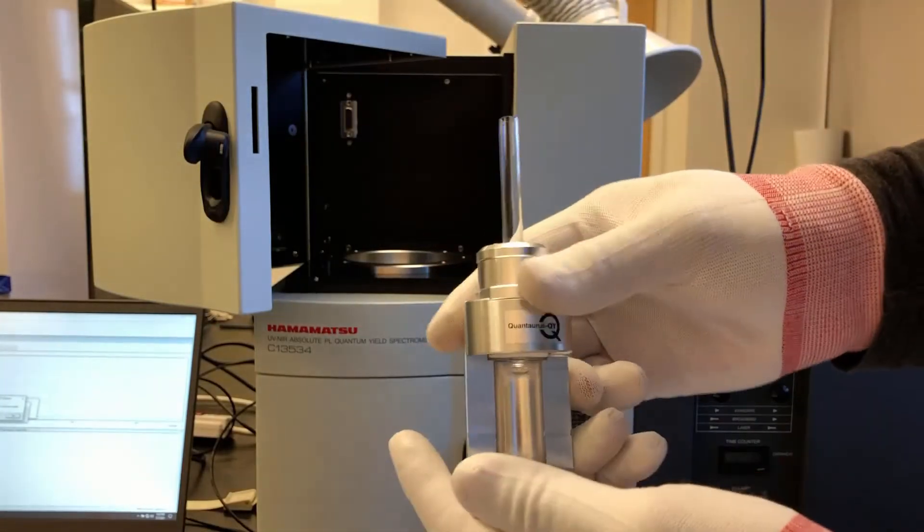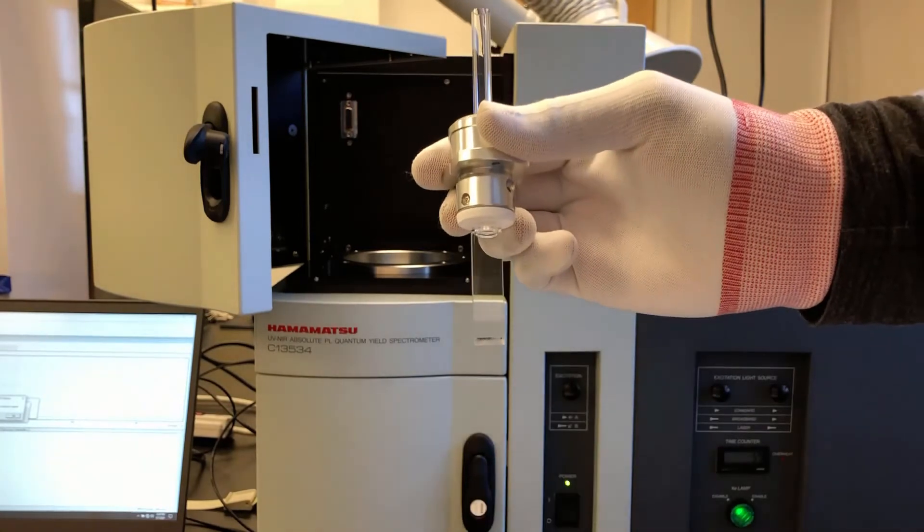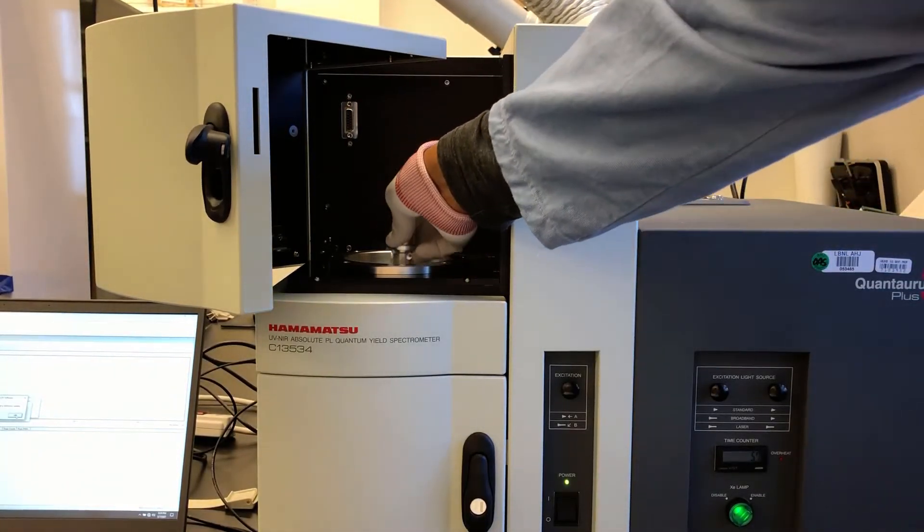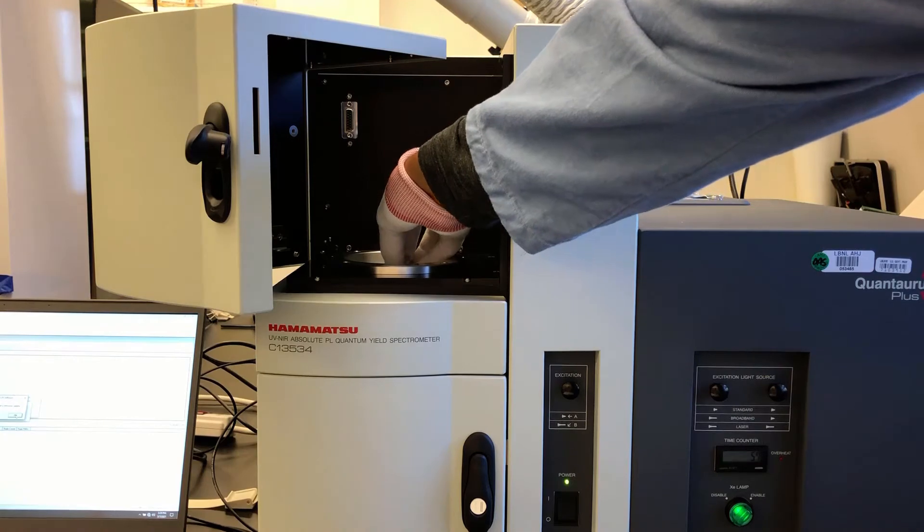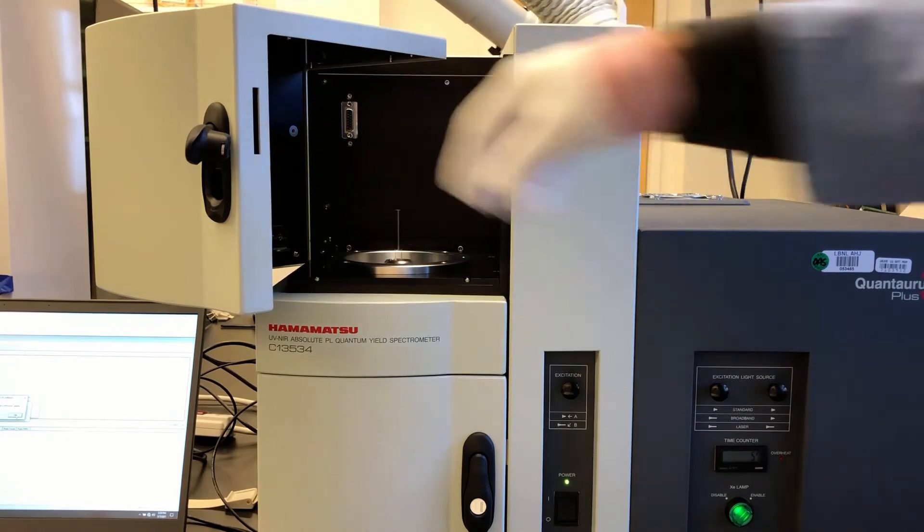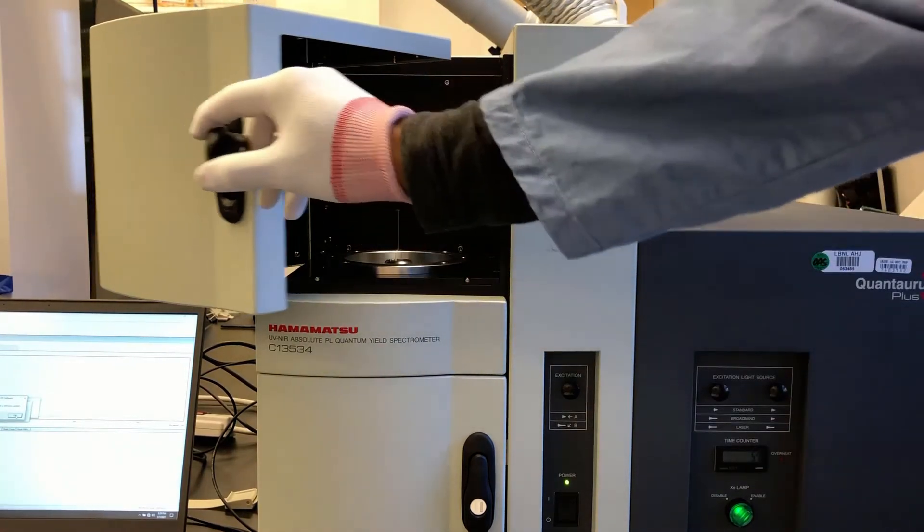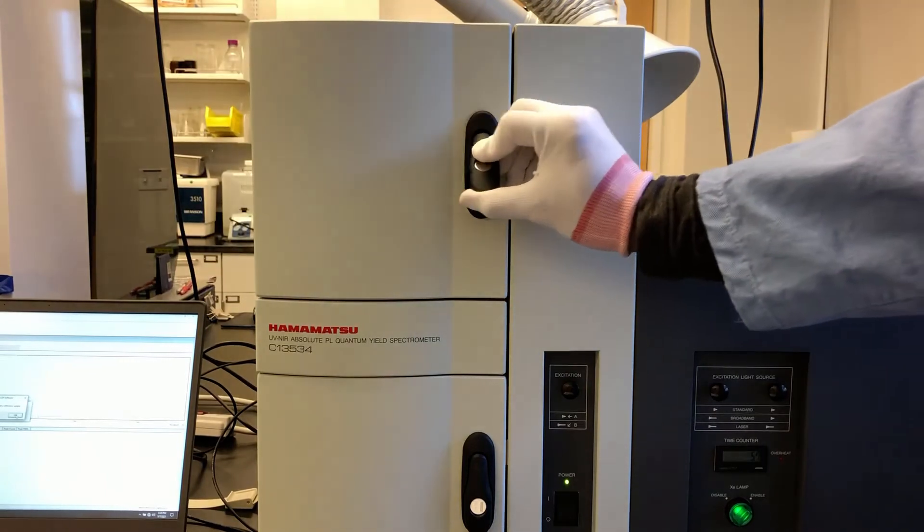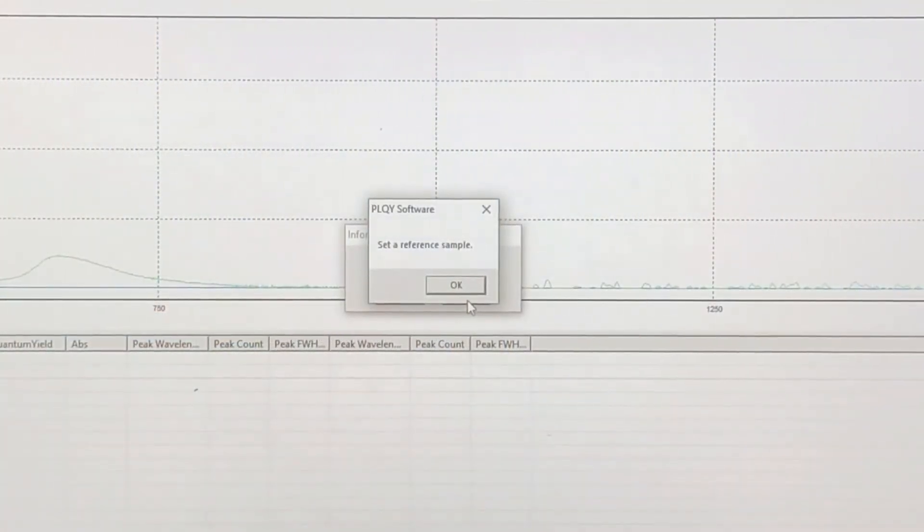We'll load the reference the same way we did the sample. Once you click ok, the reference measurement begins.